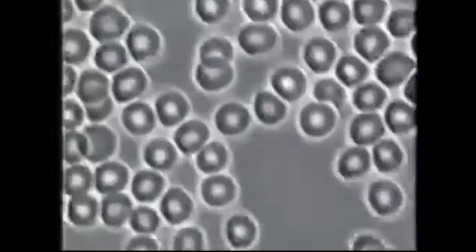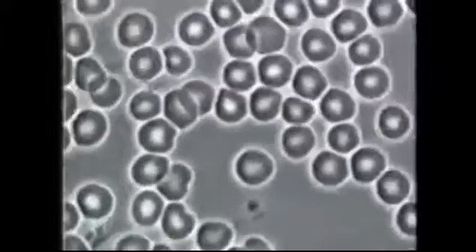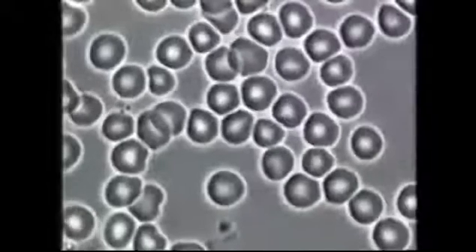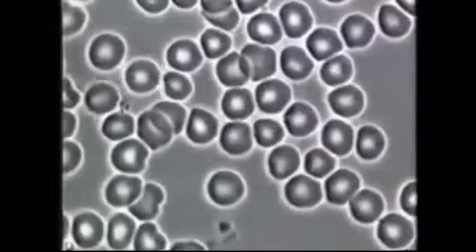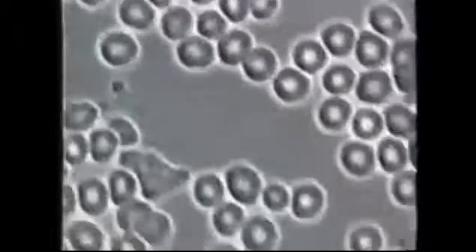Max has just eaten before this evaluation. Therefore, he has small bits of undigested fats, those little pepper particles, that are in the inner spaces between the cells. Enzymes will have these particles out of the system within 3 hours after eating.